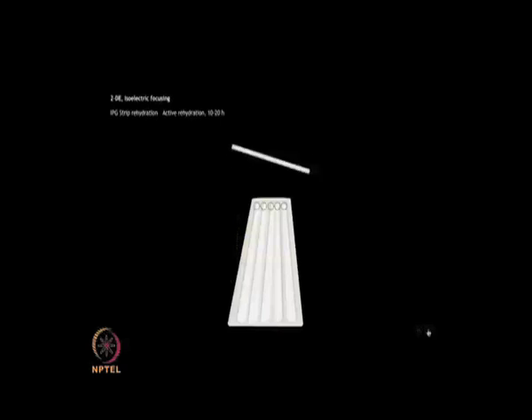The other process, known as active rehydration, is where the protein sample is added to the strip via a sample cup followed by the cover fluid to prevent the gel from drying up.